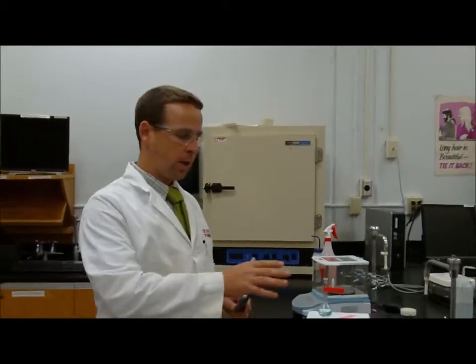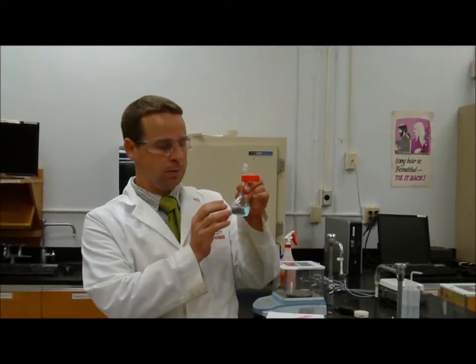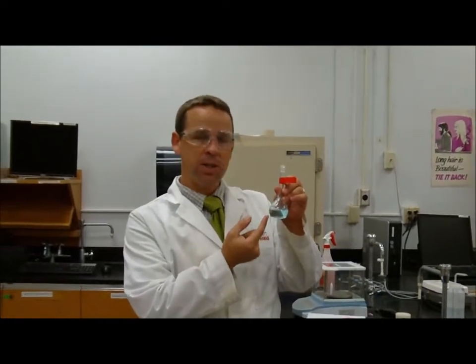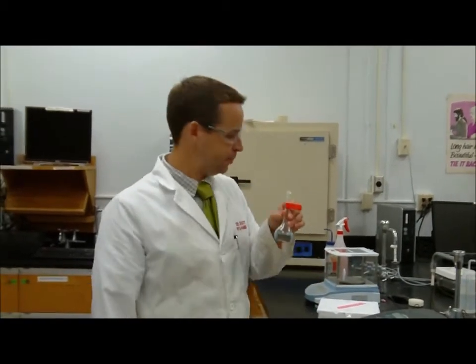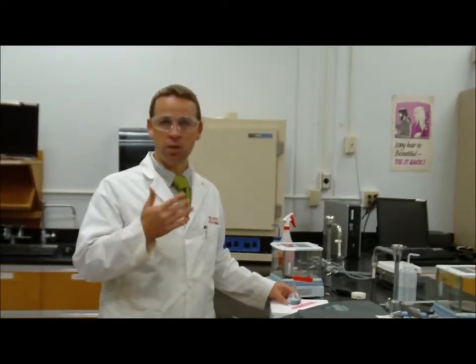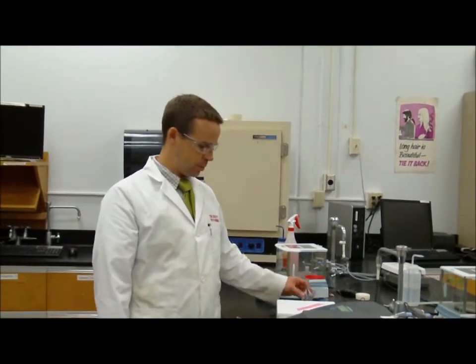To do that, I can use a spectrophotometer because the spectrophotometer will be able to identify the color, how much color there is based on the concentration, or in other words, how much light is absorbed by the chemical that's in the solution, and that's going to be related to the concentration. The first thing I need to do, though, is make myself a stock solution of copper sulfate that I know the concentration of, and then find out how much light that stock solution absorbs.